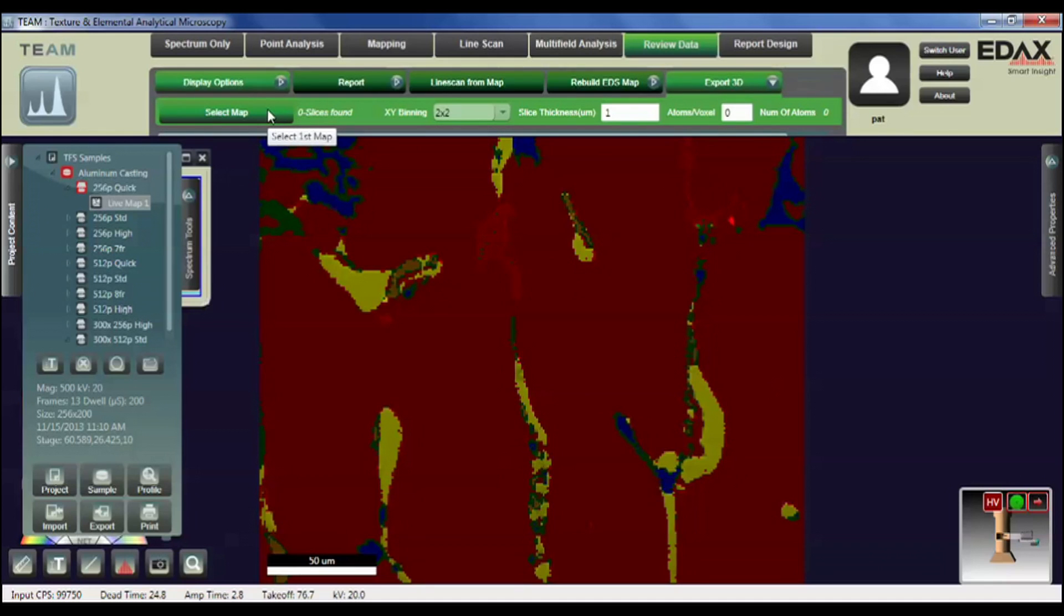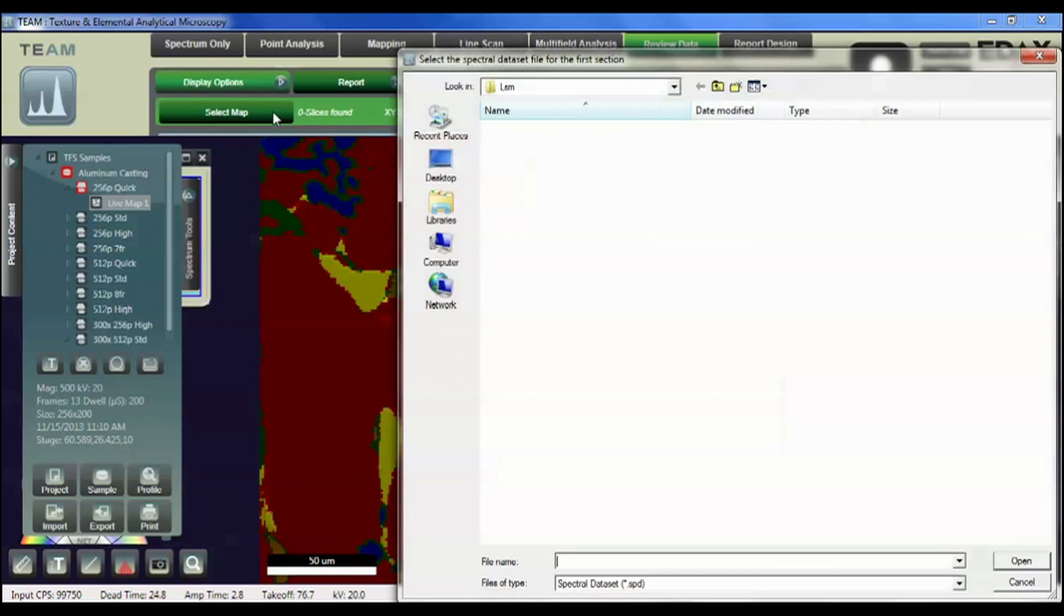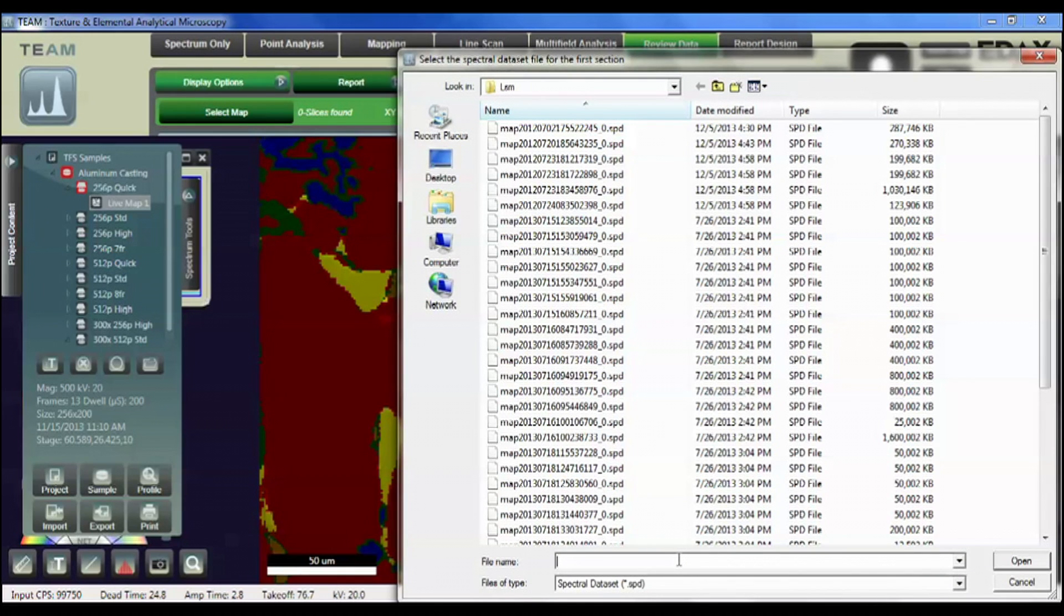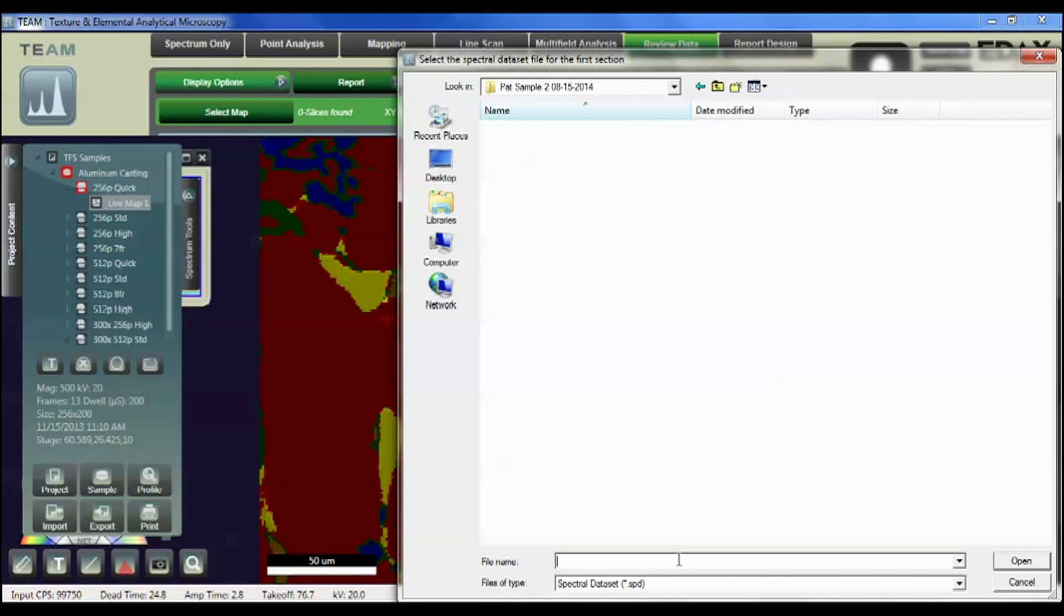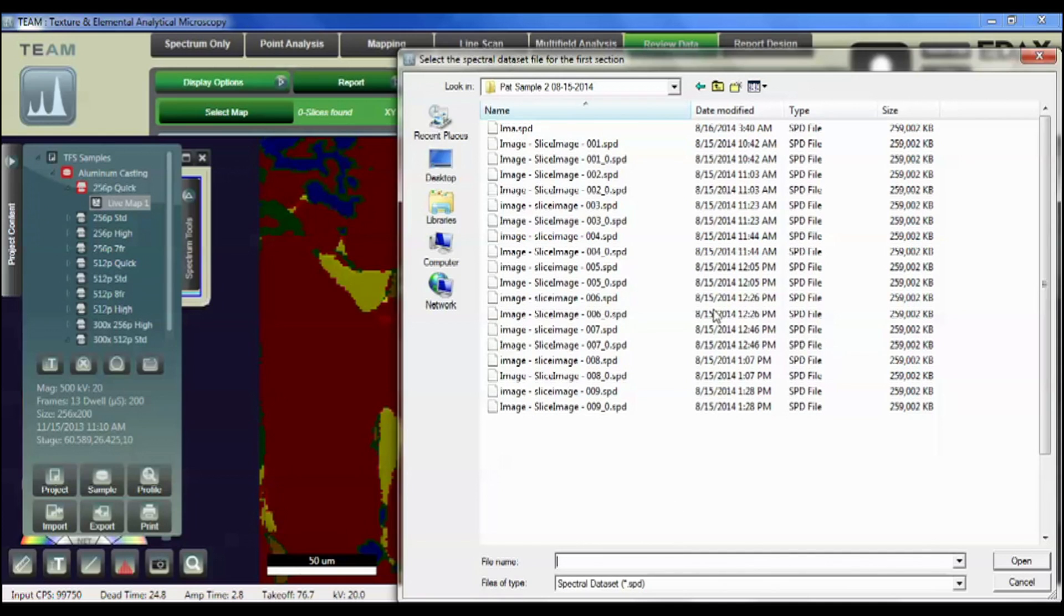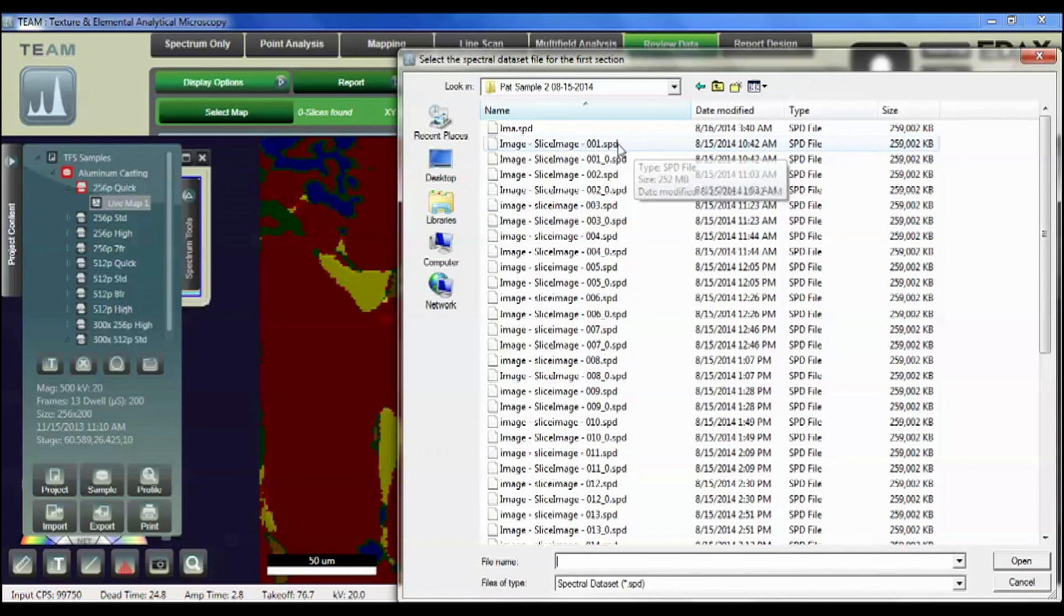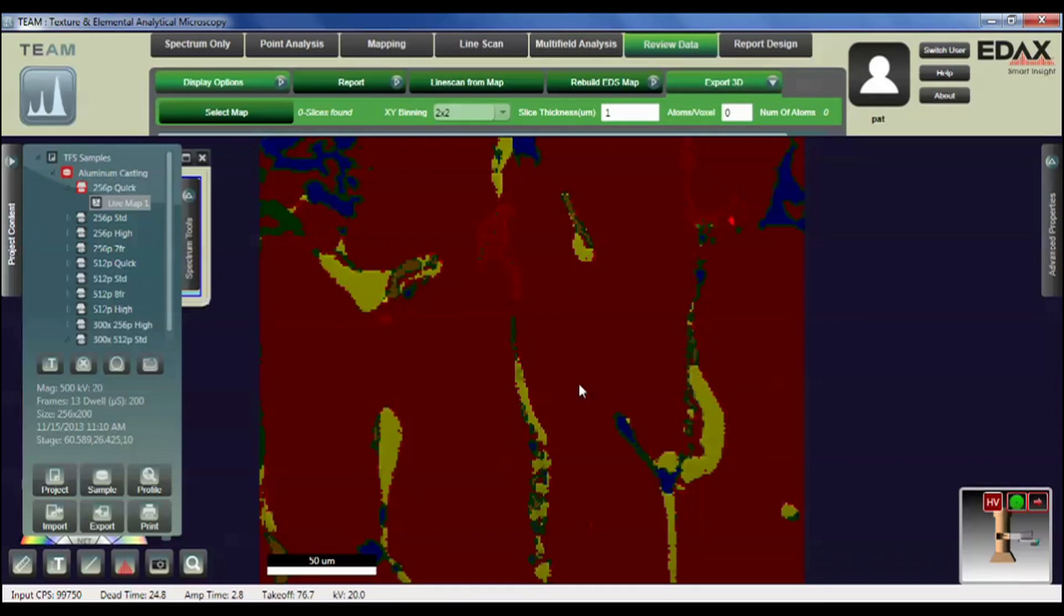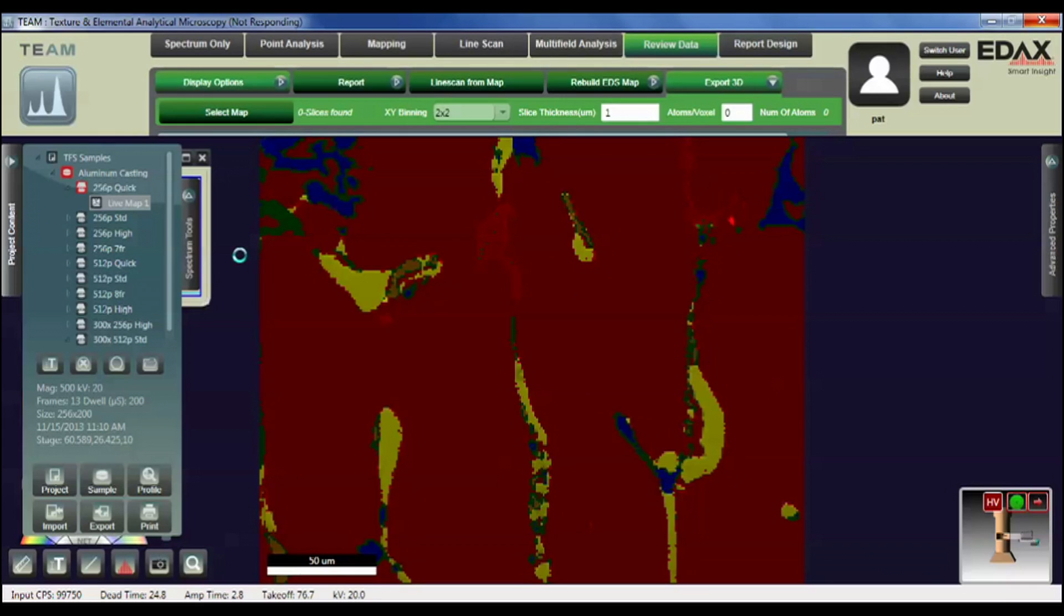So we would just process going across all the options. The first one is to select the map and then to change the directory to the location of where the data files are sitting, and here are the data files here. We select the very first map in the slice set. The system will then analyze the data set to determine how many slices are in the data set by how many SPD files are there.